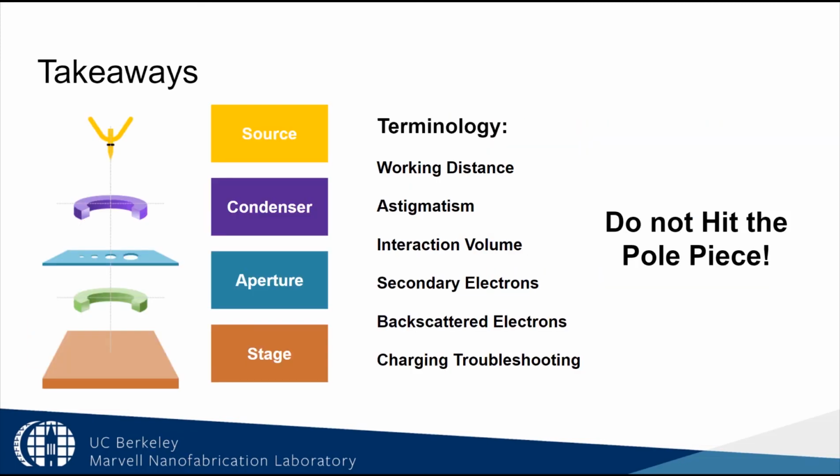This is the conclusion of SEM class. You should feel comfortable with the roles of the different components of the SEM. You should know the terms working distance, astigmatism, interaction volume, secondary electrons, backscattered electrons, and you should be familiar with how to deal with charging.